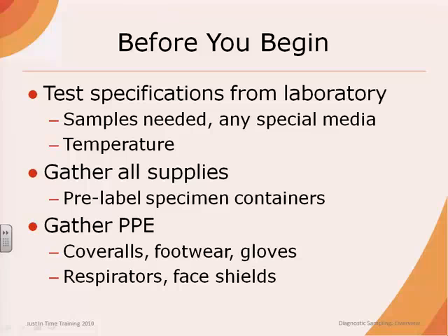First, check with the diagnostic laboratory or your team leader to determine the appropriate samples to collect as well as how they should be handled, including any selective or transport media or temperature requirements. Gather the necessary supplies you will need for sample collection as well as any personal protective equipment needed.